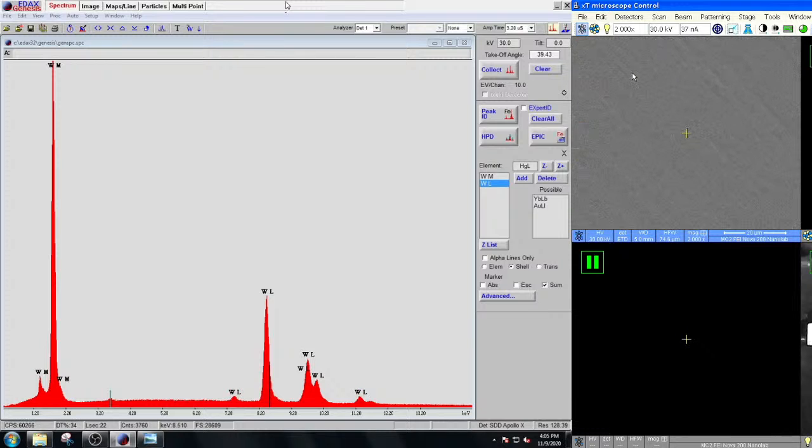So in that case, your dead time value becomes very high, because the moment the detector opens up waiting for an X-ray photon, it gets one. And then it has to shut down, measure the energy of that photon, and then open back up and immediately gets another one. So the amount of live time is very small because it's spending a relatively large amount of time measuring the energies of those photons.